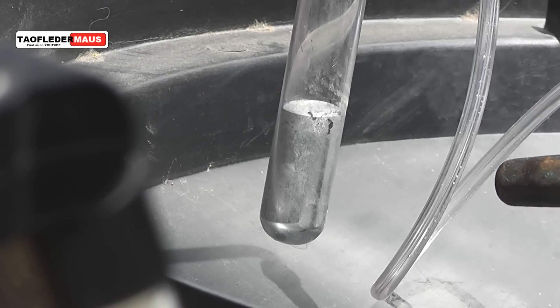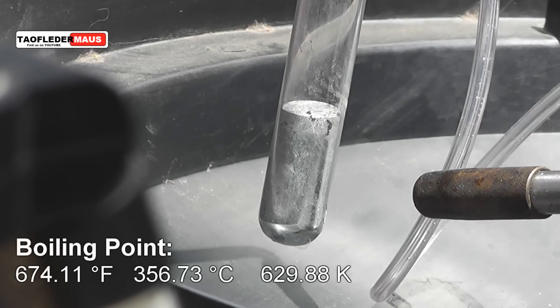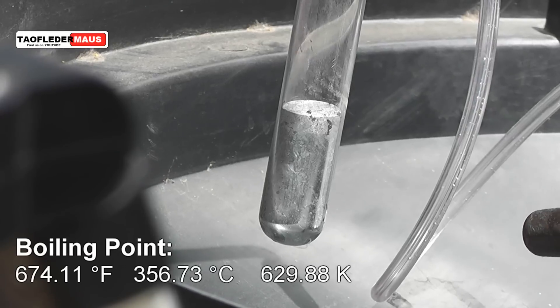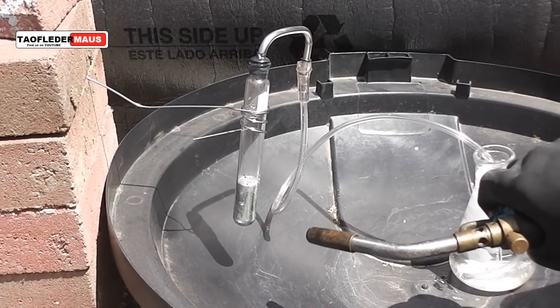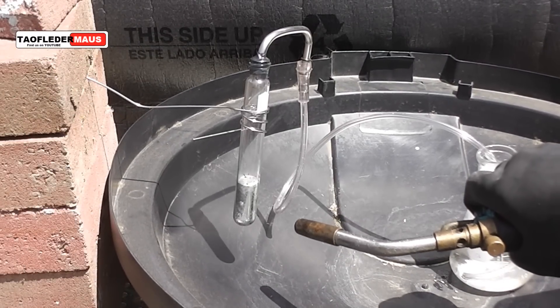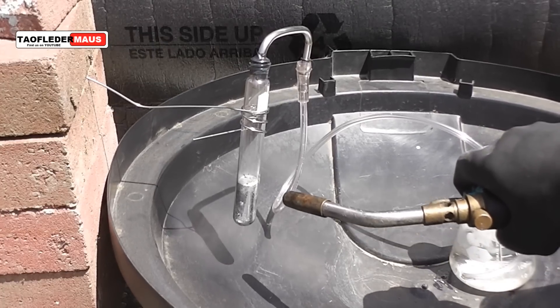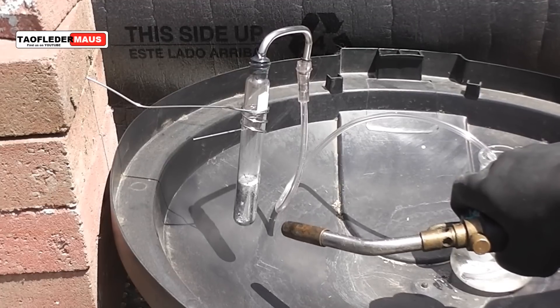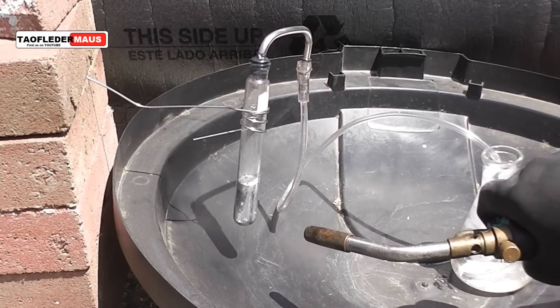I'm using a respirator and heavy gloves, and in order to get the mercury to boil we have to get it up to 674 degrees Fahrenheit. In order to control the vapors which will ultimately be released, I have this vented into a flask with ice water in it. You'll see some air bubbles, but the mercury vapors will condense rather than be released into the atmosphere.